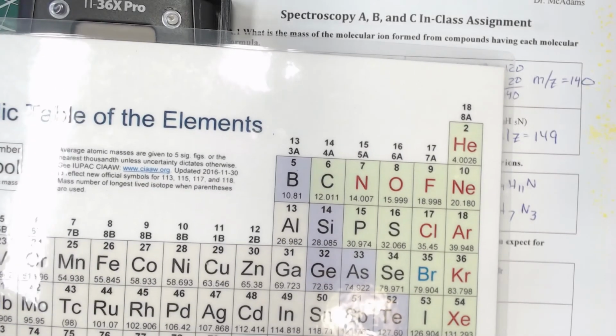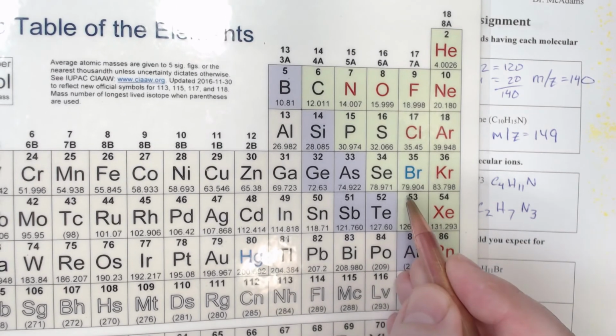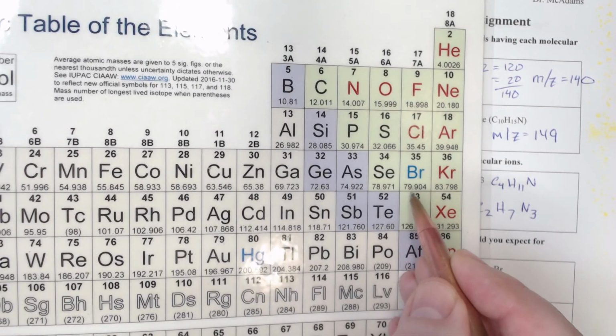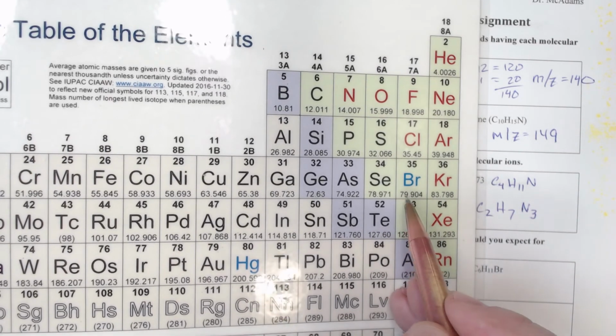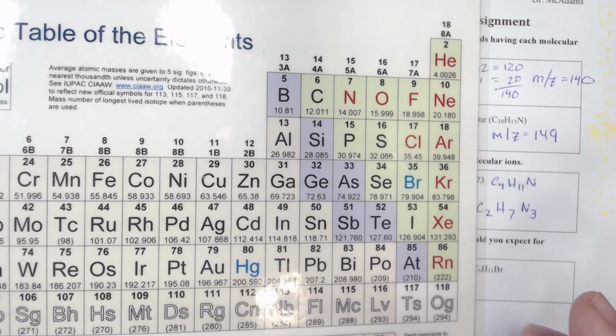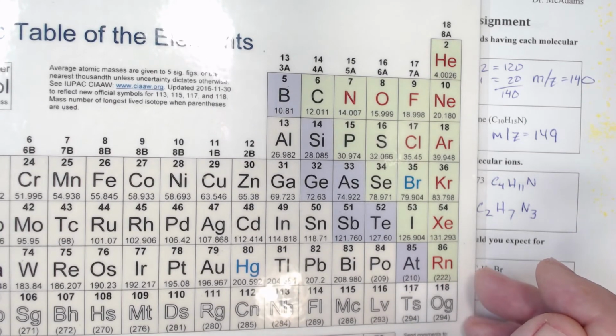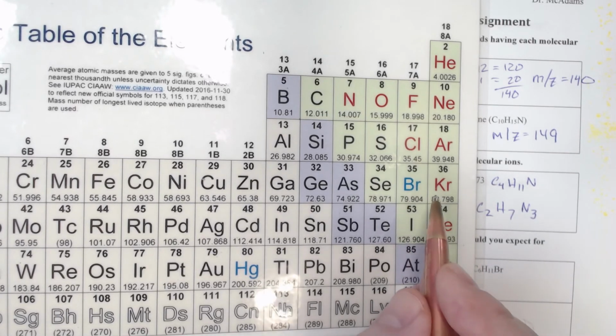Well, bromides do something similar, but we're going to look back over here. So here's bromine, right? It's at 79.90. That's really close to 80. And if you were to just guess how many bromine atoms are bromine 80, well, the answer is hardly any. The reason for that is that bromine 80 is not a stable isotope.